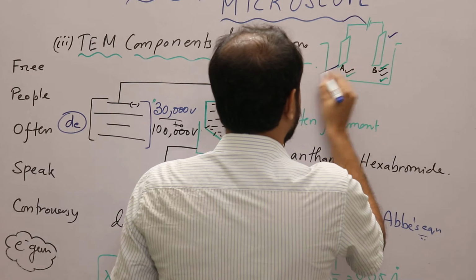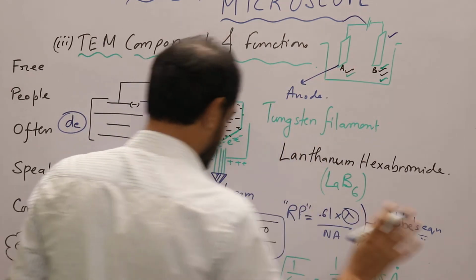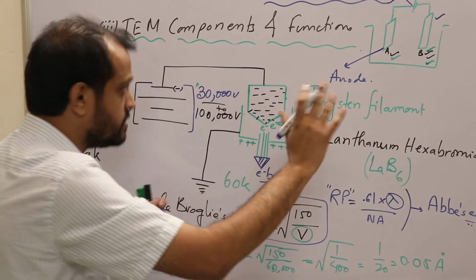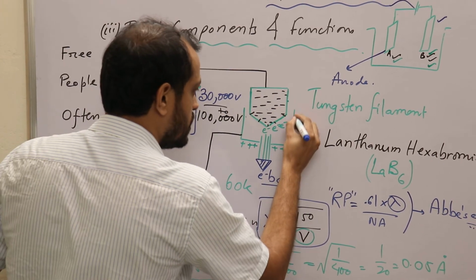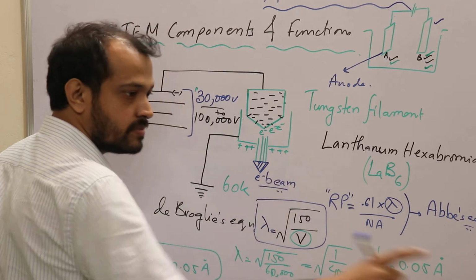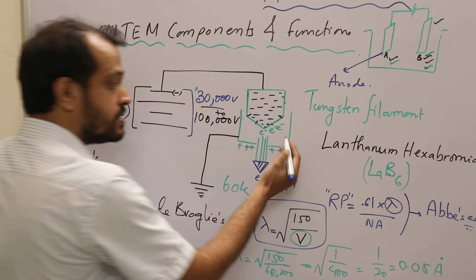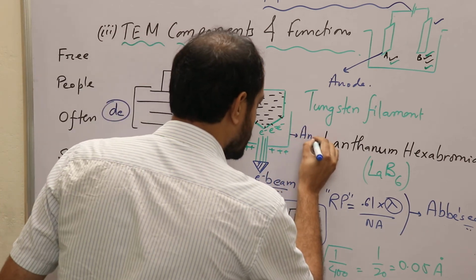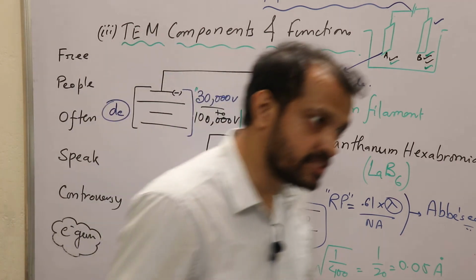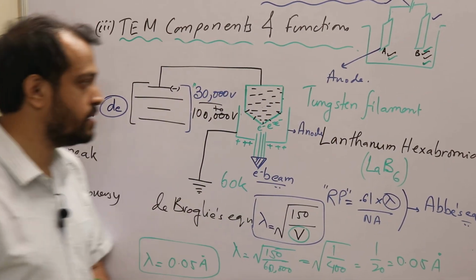Okay. Now listen. A will be what? Anode. Right. Now listen with all your attention. Utilizing this diagram, explain. Is this casket cathode or anode? This is the anode, right? And which one is cathode? The tungsten filament itself is the cathode. Okay? Clear? Okay.